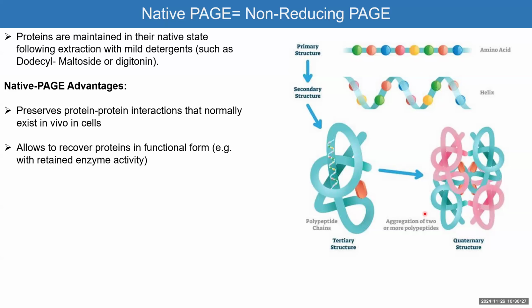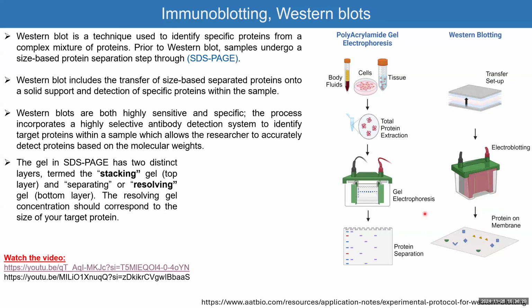So this was also the question that I mentioned in the MOOC lab. Now, in order to do the immunoblotting, we first have to do the SDS-PAGE. So we do only one extra step to perform the Western blot or the immunoblotting. We start by taking whatever sample, be it blood or cells or tissues. We extract the proteins from that, and the total proteins are loaded into the SDS-PAGE. Each sample is loaded in one well. So for example, we have here 1, 2, 3, 4, 5, up to 10.